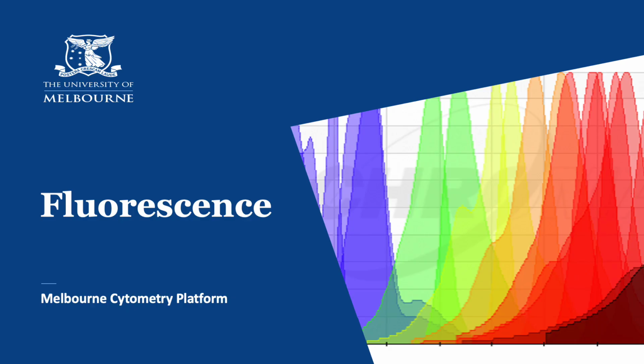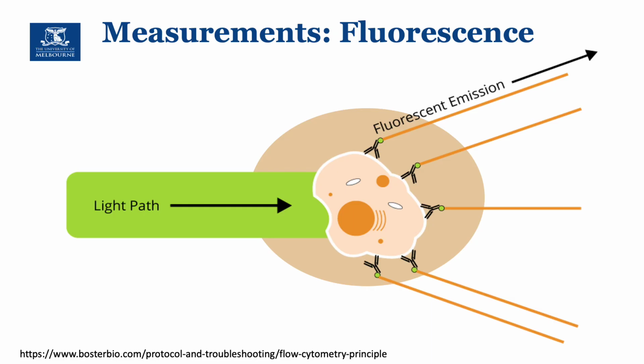Now, fluorescence is the most important measurement that is done in cytometry, at least in the instruments that we have in the platform. And fluorescence, again, happens in all angles. Instruments tend to collect fluorescence that is produced in a section of the fluorescent sphere, roughly in the same position that the side scatter is collected.